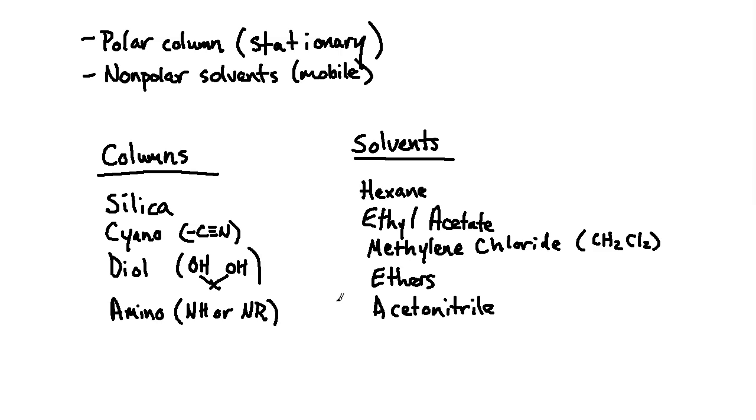And then on the cusp or the outer edges are those extremely nonpolar or polar solvents that are usually reserved. And that's not to say you might not have a small bit of methanol or something like that thrown in some of your normal phase. But generally speaking, you're sticking more towards these that are going to make up the primary targets for your solvents in a mobile phase, in normal phase HPLC.